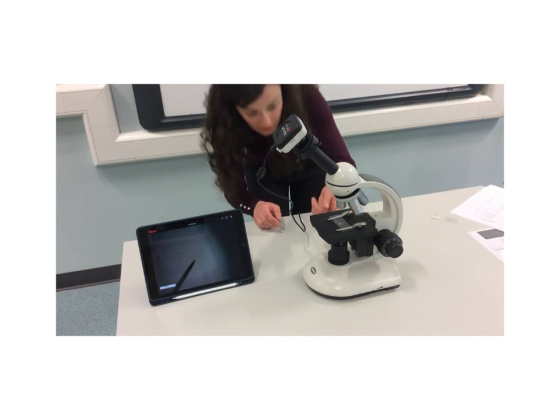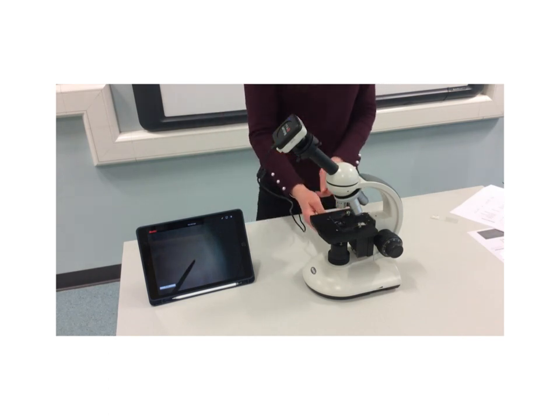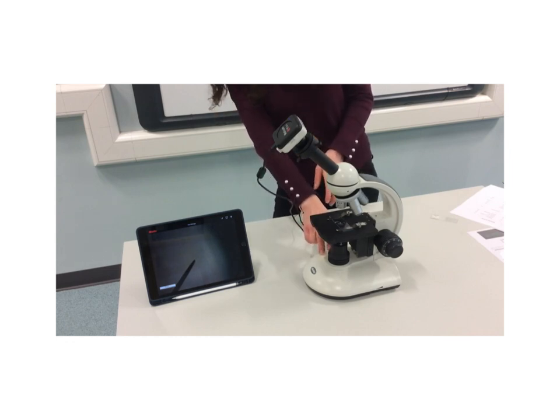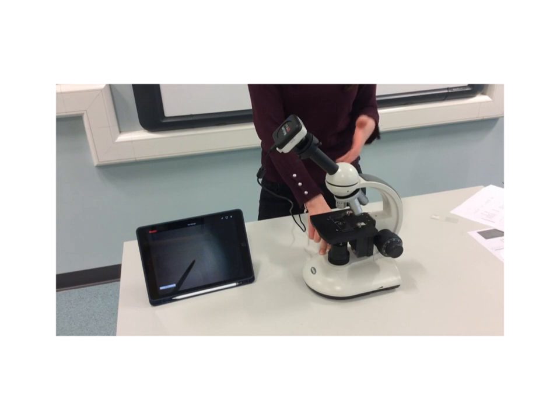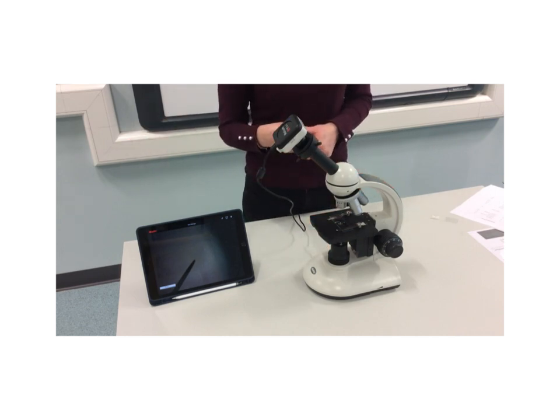Underneath the stage, it might be hard for you to see in the video, but you have what we call the diaphragm, and remember we spent a bit of time in class learning the spelling of that. It's a little bit complicated. And then down below we have our light source, or sometimes, as we said, that can be a mirror reflecting light off a lamp, but that would have to be separate.